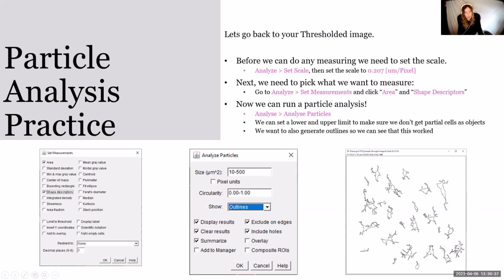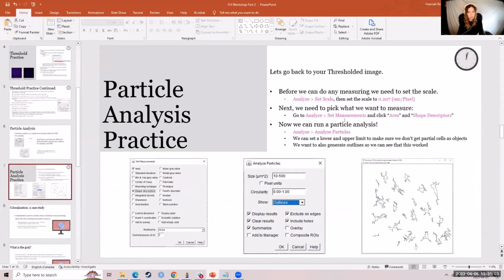analyze. A good example of why this is really important is if you have a very, very large data set acquired by multiple people, or if something happened where an image is partially or completely out of focus, cells will appear more blob-like if you're doing morphology, and this can be a problem. You can also gate to what size you want to include, and in some cases to circularity. So I will go back and do that.